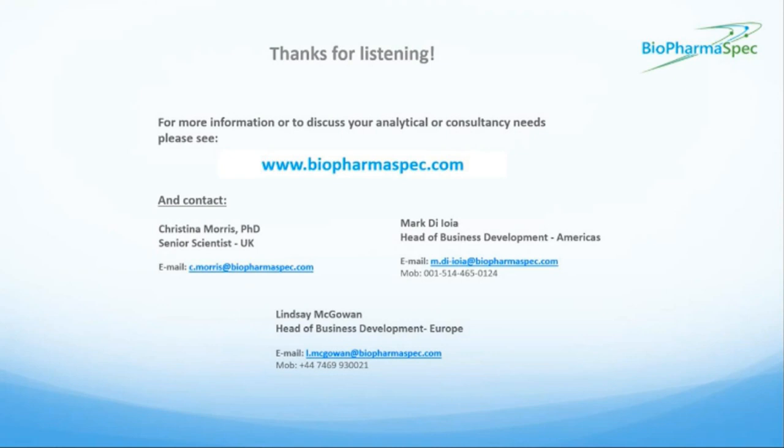Sure. So if we start with the ELISAs, I think most of us know they're high throughput, they're highly sensitive, and they can be off the shelf, so with straightforward testing. A generic or platform ELISA will detect the majority of the HCP species, but it won't detect proteins that are specific to a manufacturing process, which is why people also develop process-specific kits. But these can be costly, so that's a downside, and they can take time. And of course, there's also still the drawback of missing any low reactive or poorly immunogenic HCPs.